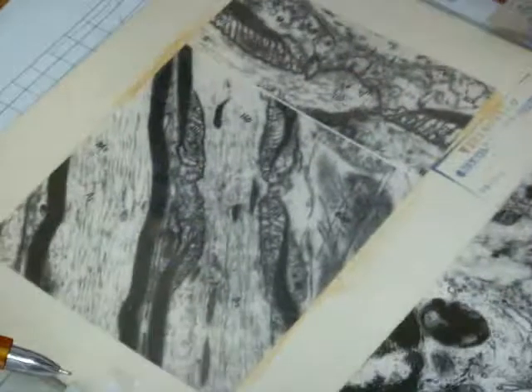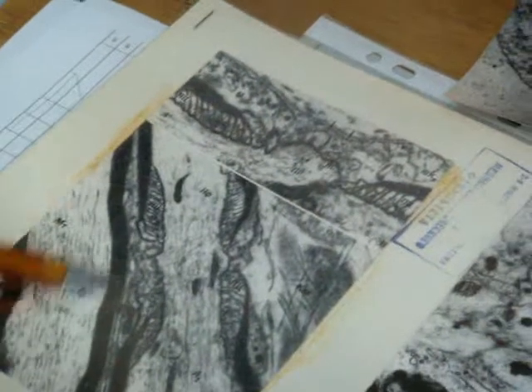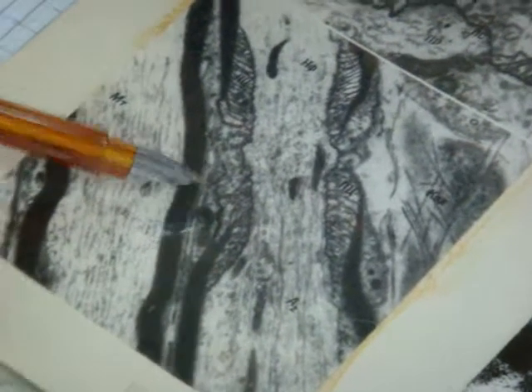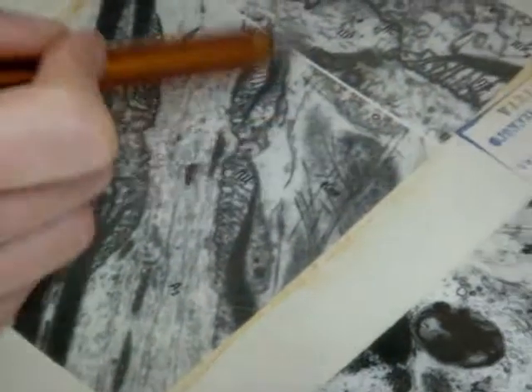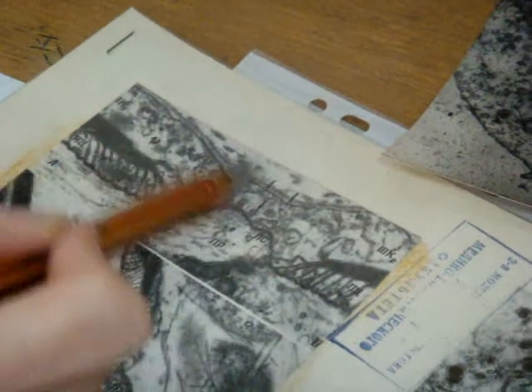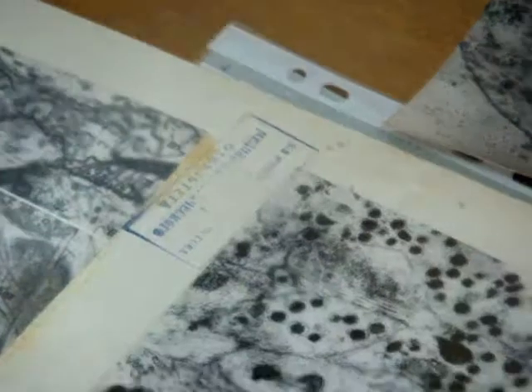Let's begin. This is a longitudinal section through a nerve fiber. Myelinated, and we can see myelin sheaths. This region is a node of Ranvier. This portion is at high magnification, with the nerve fiber, the cytoplasm of the Schwann cell, and the basement membrane above.